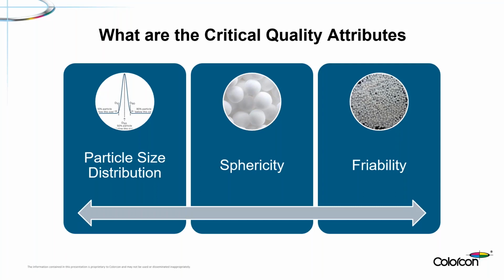Friability. Friability of the uncoated core at early stages of the drug layering process will cause changes in the total surface area of the batch. And if serious enough, this will result in changes in film thickness of any subsequently applied controlled release coating layer, leading to changes in dissolution performance.